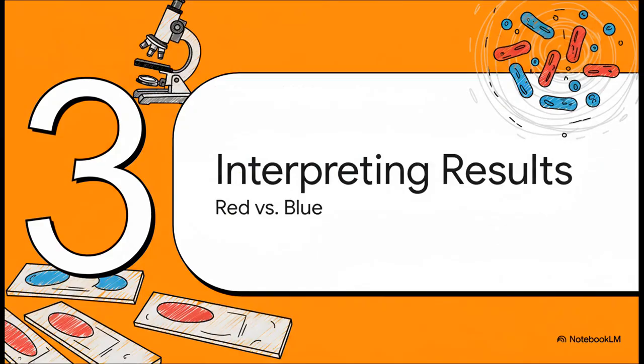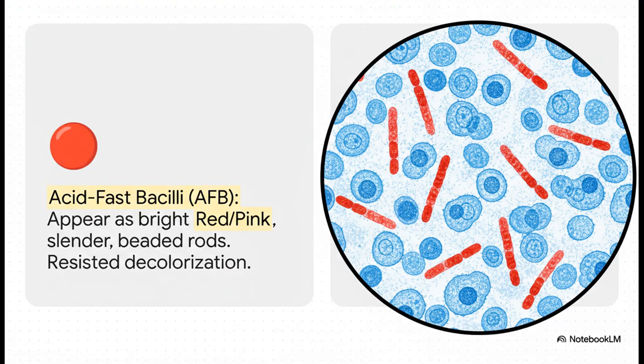All right, we've done the hard work. We've stained our slide. Now for the moment of truth. Let's learn how to actually interpret what we're seeing under the microscope, because this is where it all comes together. This is where the diagnosis happens. So what are you actually looking for?